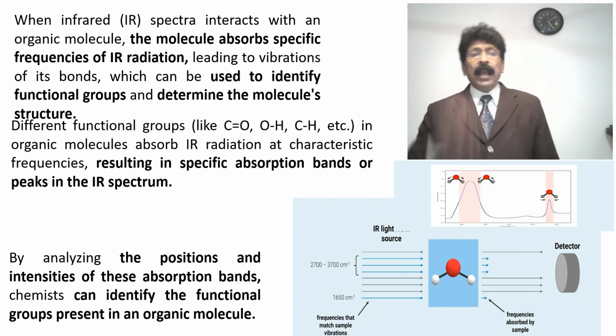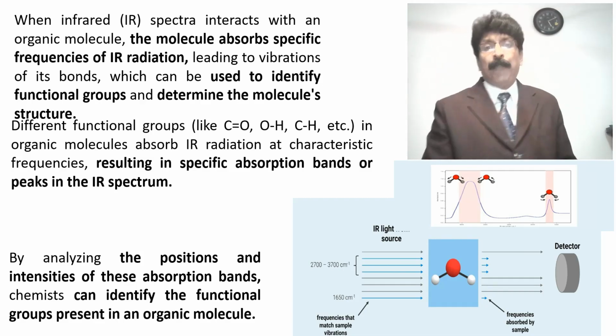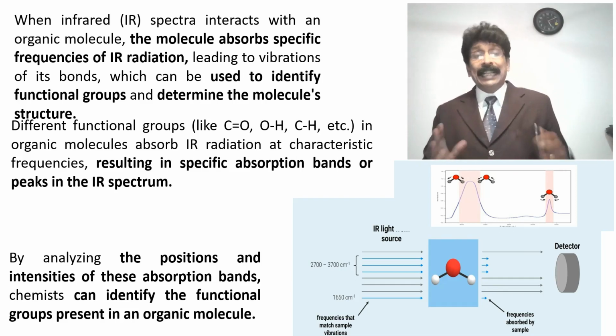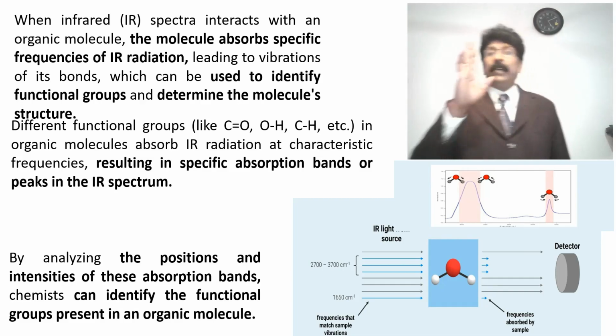By analyzing the positions and intensities of these absorption bands, chemists and pharmacists can identify the functional groups present in an organic molecule.